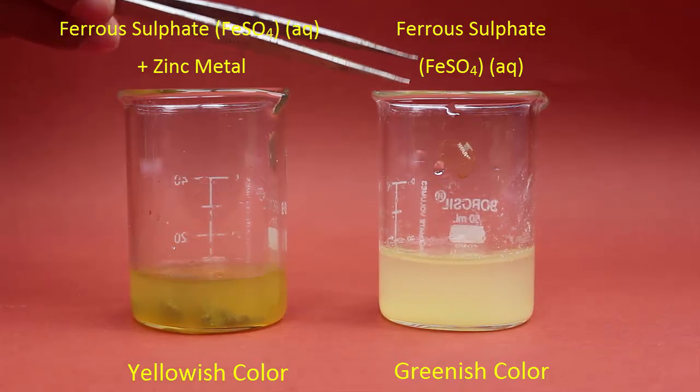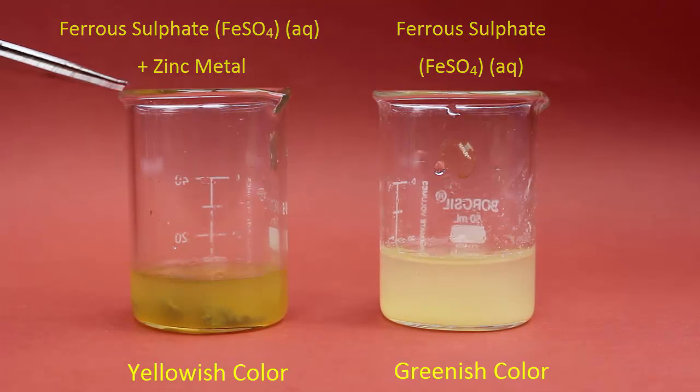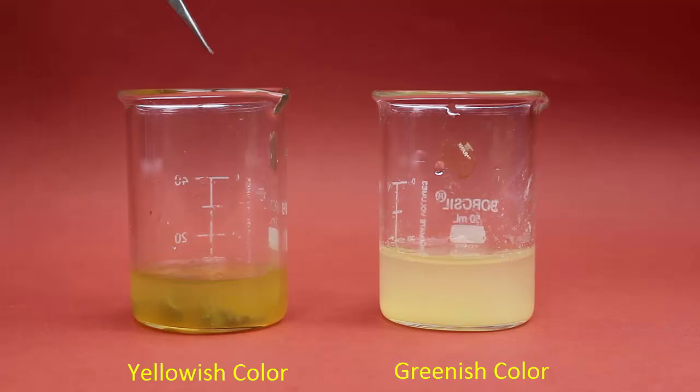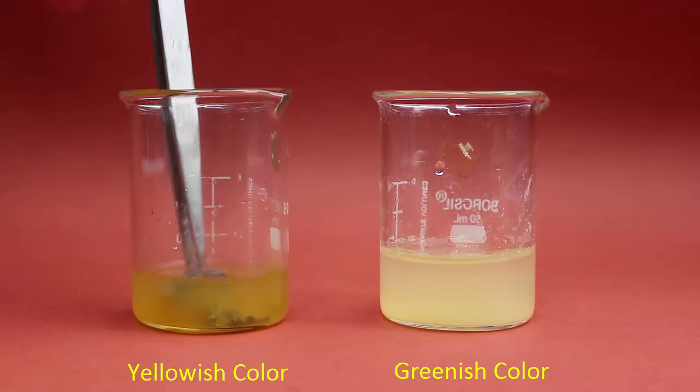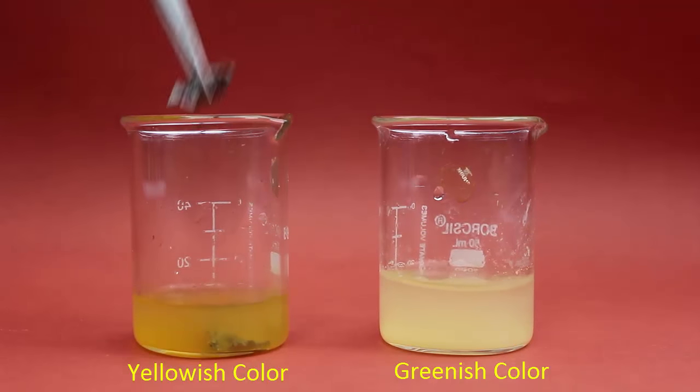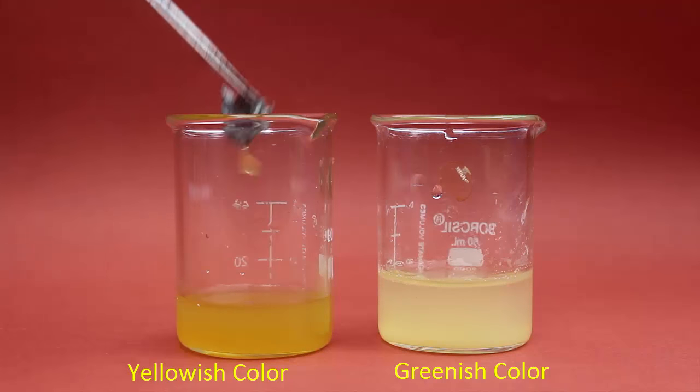This is a freshly prepared ferrous sulphate solution which is faint green in color. Now this was the reaction mixture where ferrous sulphate is reacted with zinc. Now if I lift up the piece of zinc and kept outside.